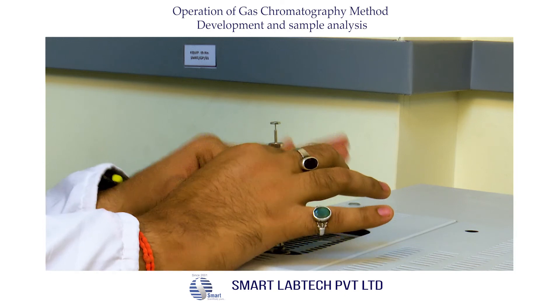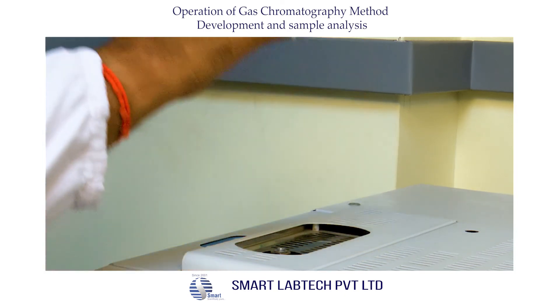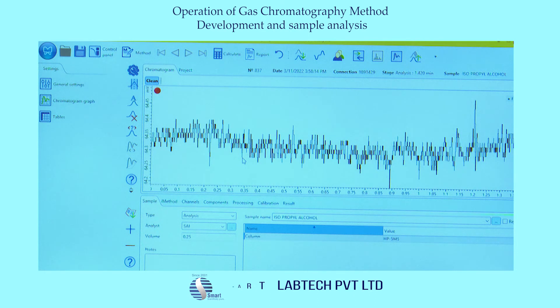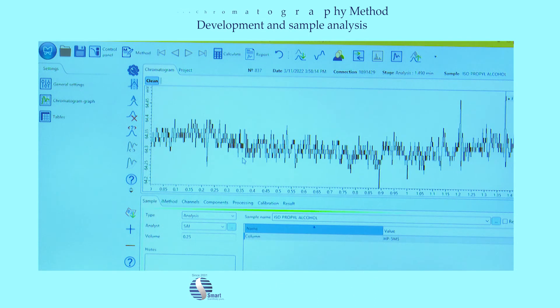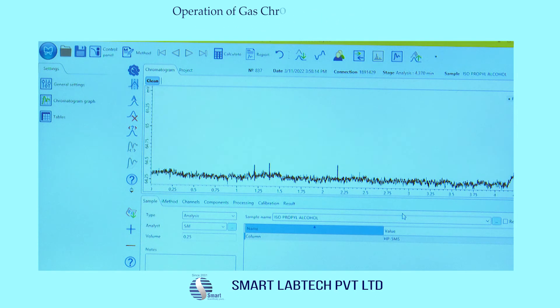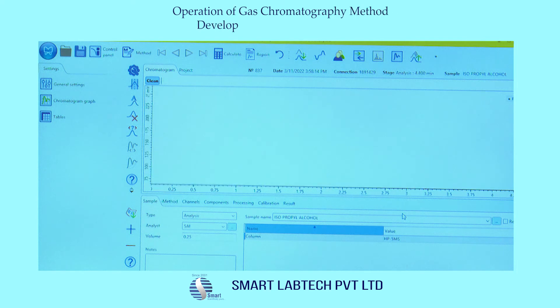Inject the sample quickly into the injector port and press the Start button (number 1). After injecting the sample, the software starts recording the chromatogram. Watch the IPA peak elution in the chromatogram and wait until the run time is over.